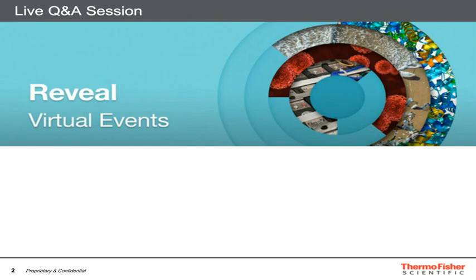In slide 4, for the benzene ring, I guess, all the images I showed in this presentation were taken on a Spectra system, the Spectra 300 specifically. Clear. Thank you, Min. The next question: besides viewing the benzene ring system, is it possible to also view organic structures or intermolecular bonds in inorganic materials?